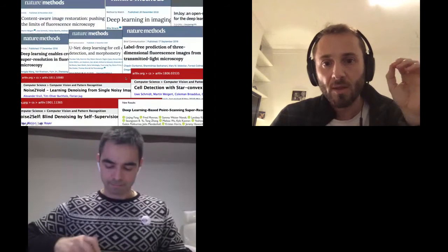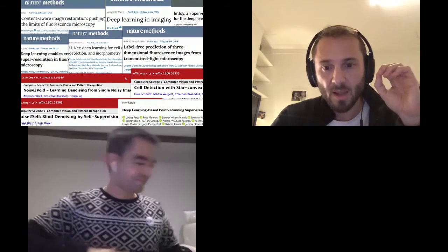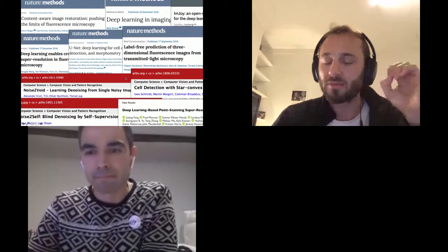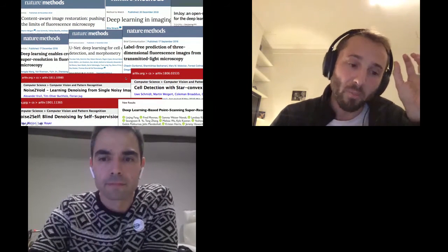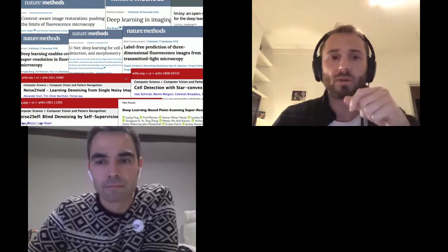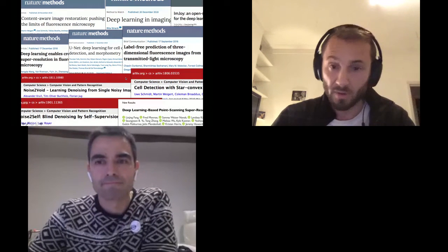Because Ignacio has already given you an amazing historical overview, the only thing that we'll add before showing you a few things is that the last couple of years, literally the last 24 months, have seen an enormous explosion of publications in the field of applying deep learning to bioimage analysis, to microscopy, to histopathology, to even natural sciences.